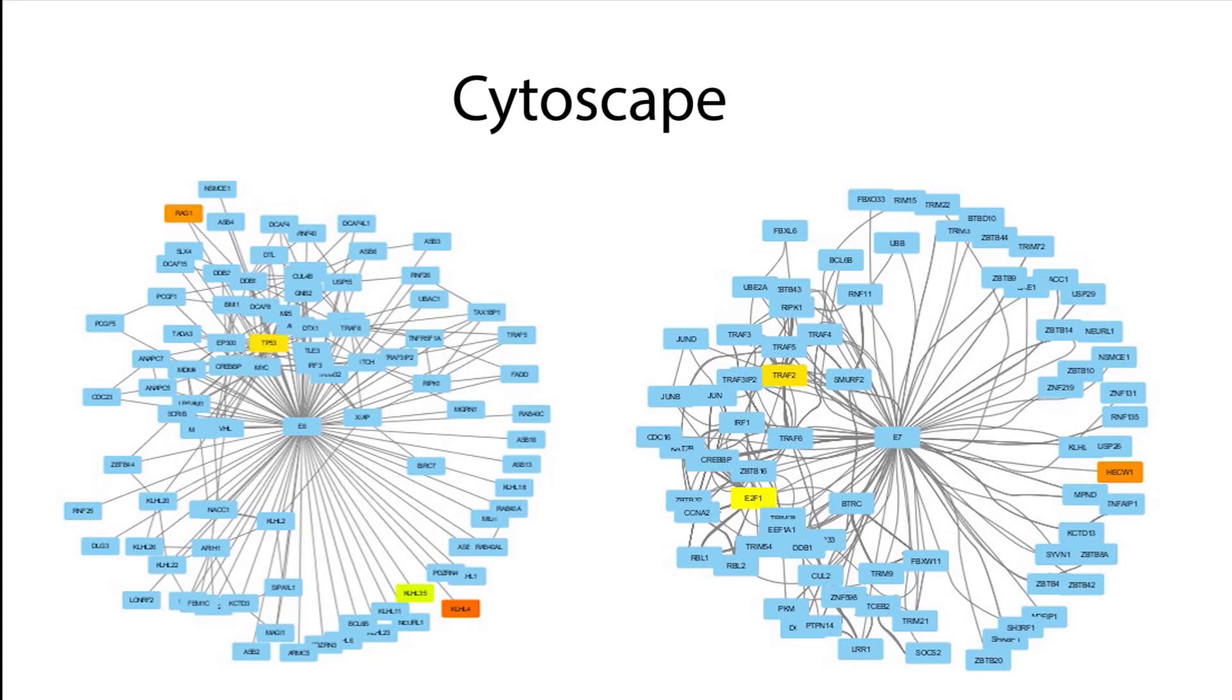This video describes how to add gene expression data to a protein-protein interaction network using Cytoscape.